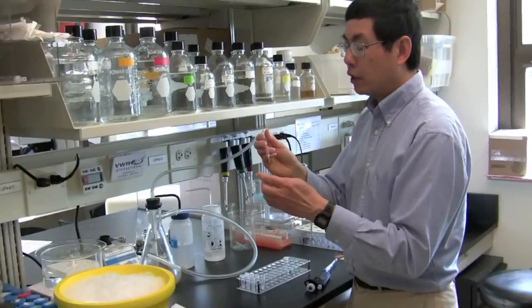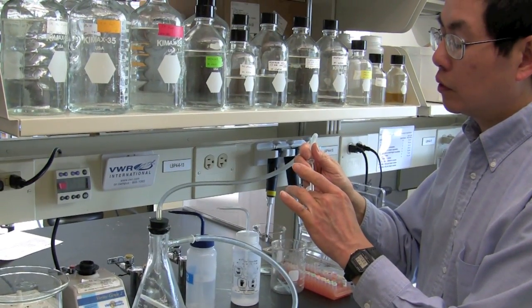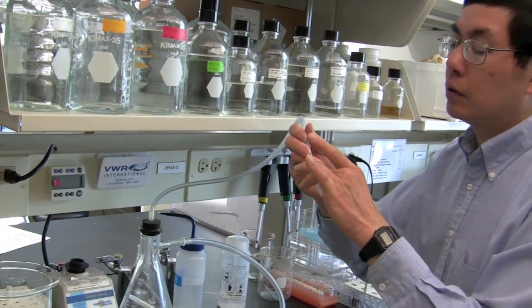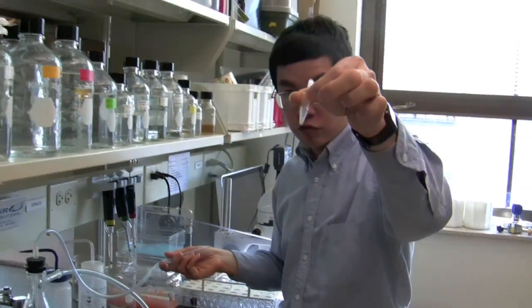I'm now going to aspirate off as much of the supernatant as I can without picking up the pellet itself. Okay, so you can see it's relatively dry.